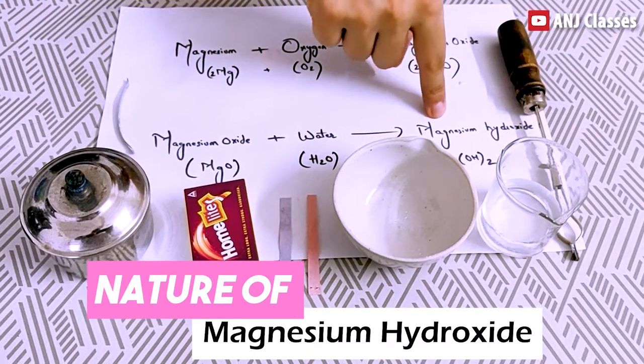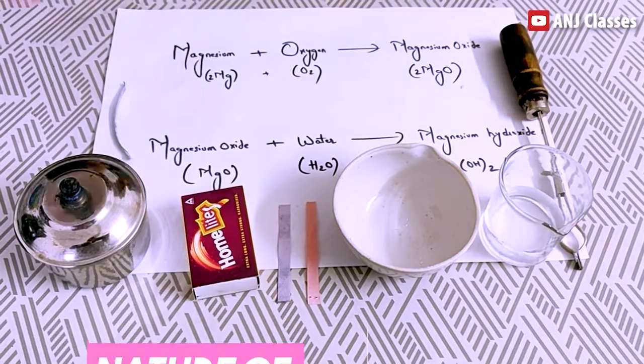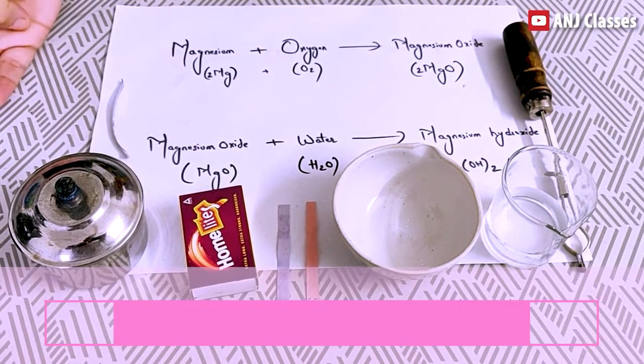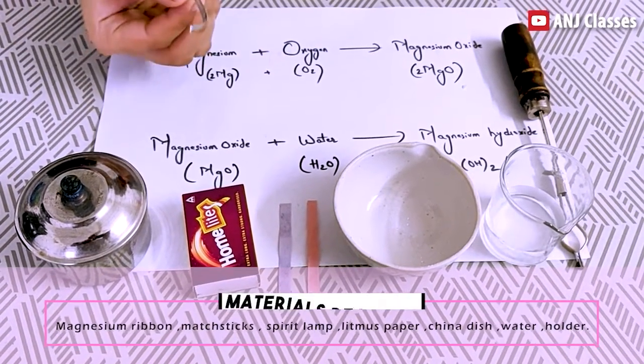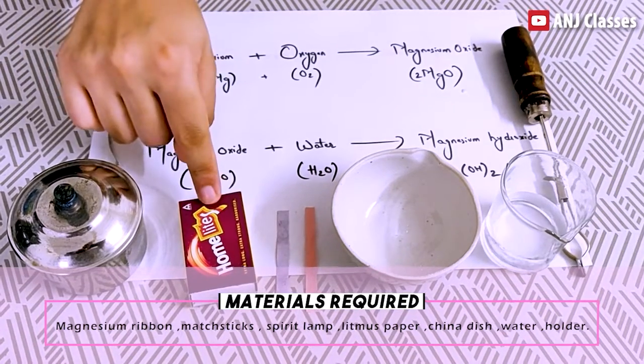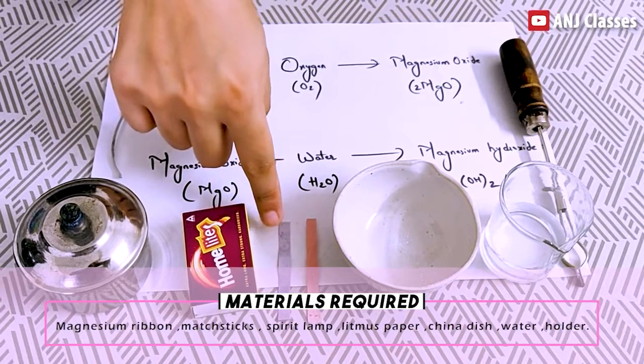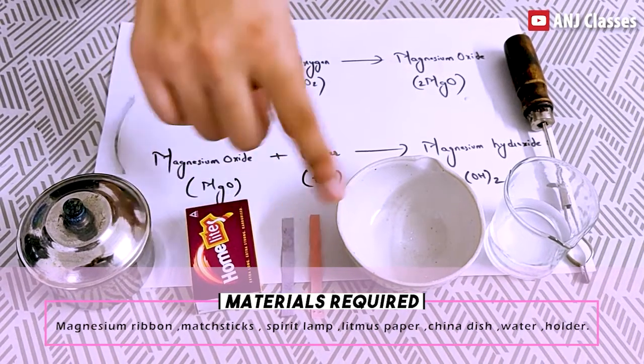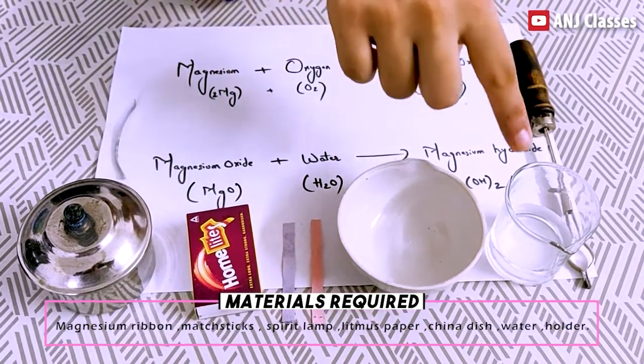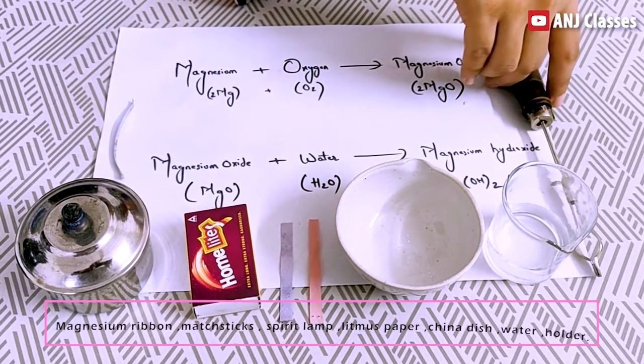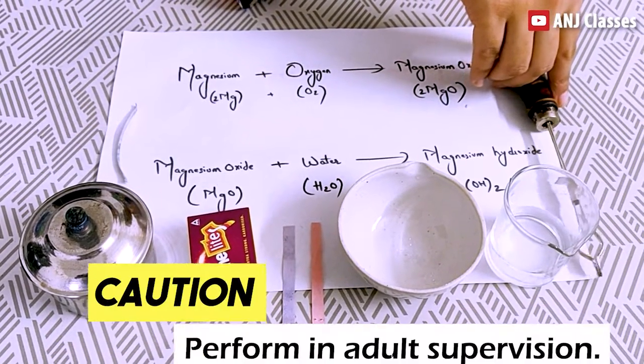Material required for this activity: a small piece of magnesium ribbon, matchstick, spirit lamp, litmus paper red and blue, china dish, water, and a test tube holder. As I don't have pair of tongs, I will be using test tube holder.